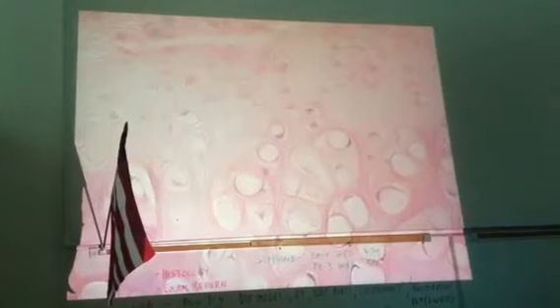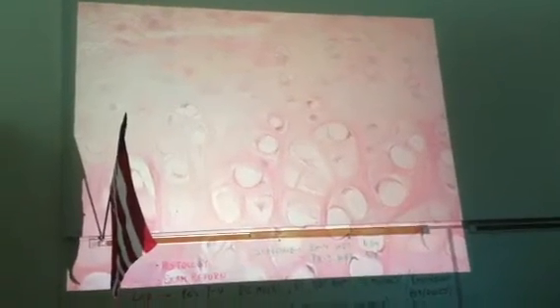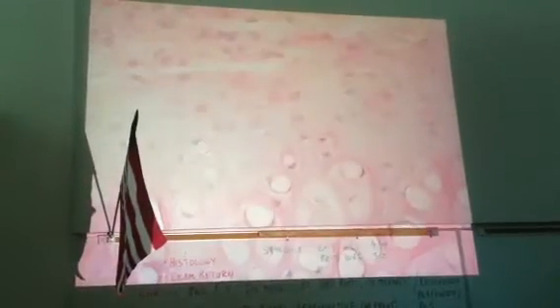So there's the lumen of the trachea. We're coming this way, coming across some fat and some mucus glands, and now all of a sudden we're going to run into cartilage. So there's hyaline cartilage right there, and that's what it says. We have hyaline cartilage, and the perichondrium is the connective tissue that's around this that has potentially stem cells, and on this side you see it best. Right here. So there's the perichondrium, and that's the hyaline cartilage.